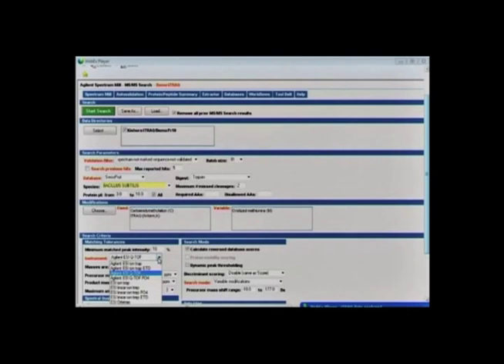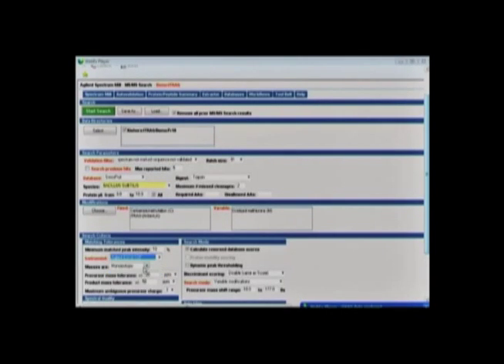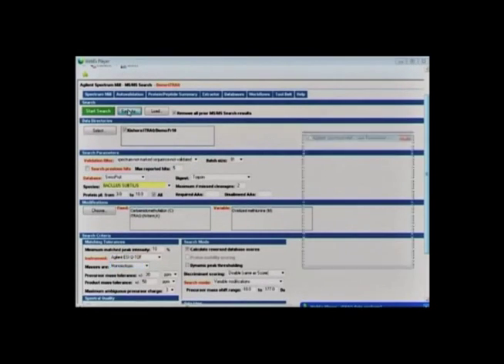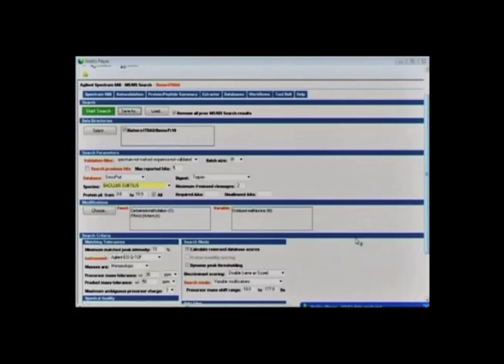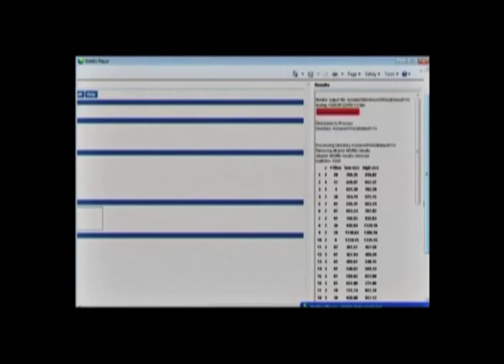Instrument is selected as Agilent ESI QTOF, masses as monoisotopic, precursor mass tolerance as 20 ppm and product mass tolerance as 50 ppm, which is quite good to proceed for data analysis. Once all the parameters are assigned, start the search, and the search results can be monitored in real time in the right side tab.